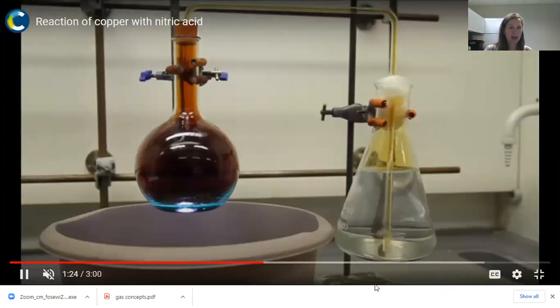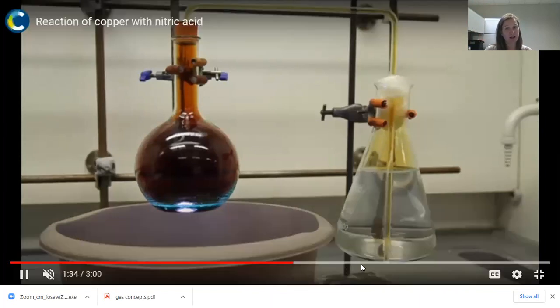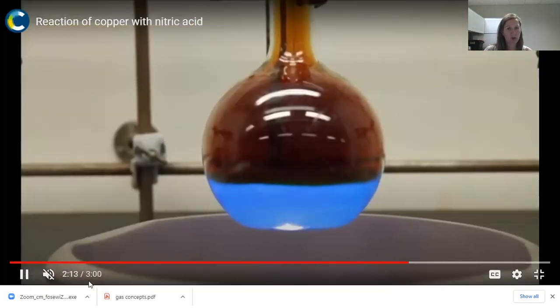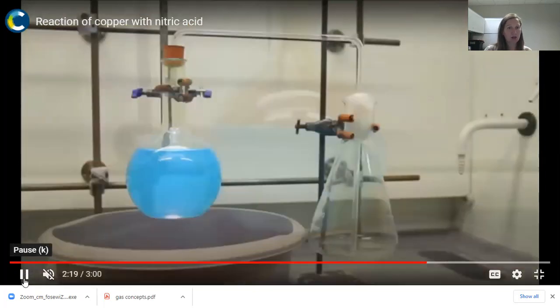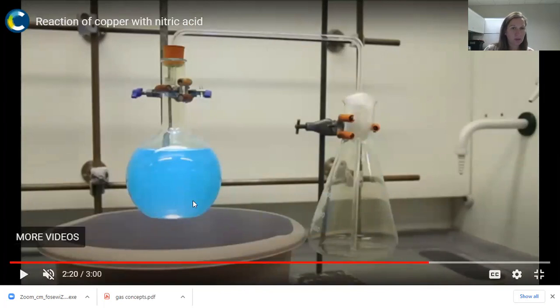But what we would do in lab is we would gently heat our flask under the hood until there was absolutely no more brown gas coming out anymore. And then we would bring it back to our station and do the next reaction. So I'm going to fast forward a little bit so you can see once the brown gas is completely gone, that it is a brilliant blue color. If I pause it quickly there, you can see it's a blue, clear solution.